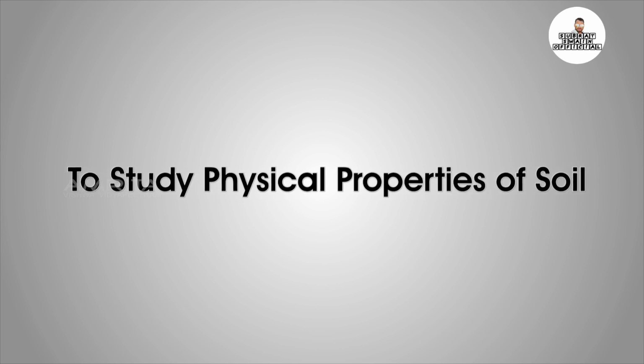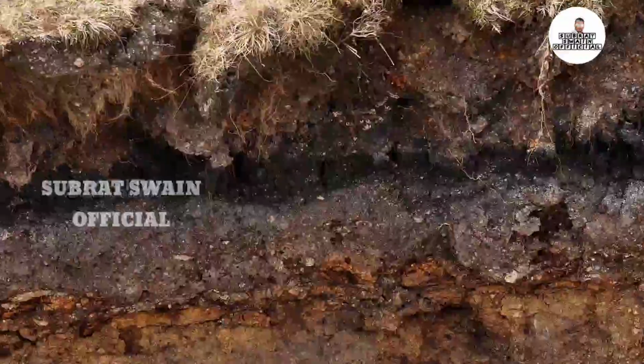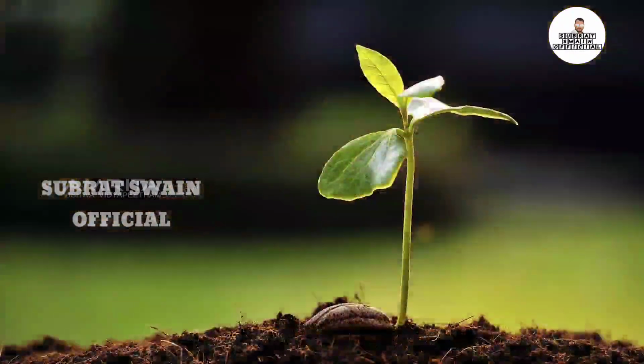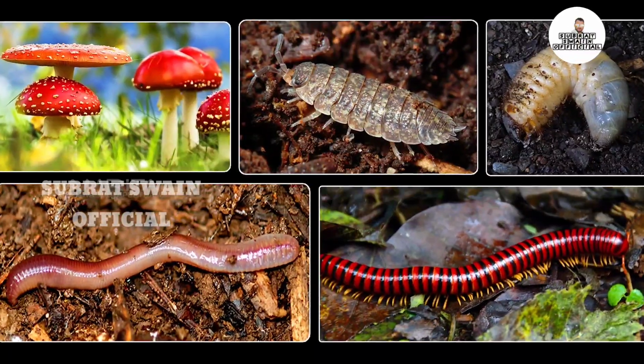Study the physical properties of soil. Soil is the upper humus-containing layer of the earth, consisting of rock and mineral particles mixed with decayed organic matter. Soil sustains plant life and contains numerous living organisms.